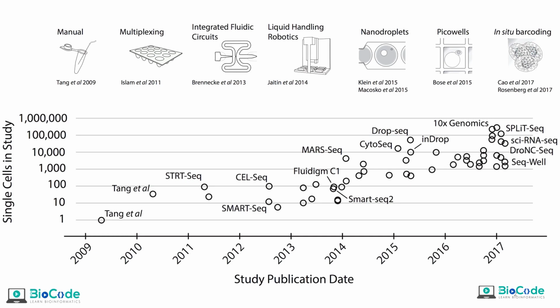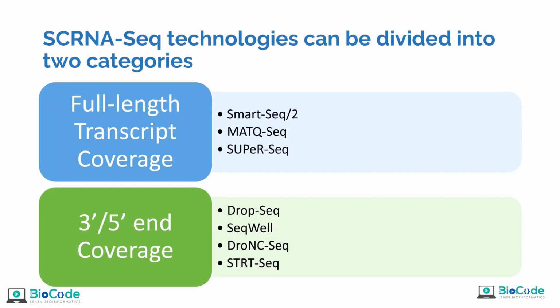Other than that, the analysis of the data generated from these technologies does not vary that much. The analysis procedures and the analysis steps are almost similar. The only difference is how the cells were obtained, how they were prepared for sequencing library, how the RNAs were extracted from them. That's it. Single-cell RNA sequencing has outgrown the other technologies, especially in genomics work, and it is a highly utilized technology and even has developed further technologies such as spatial genomics and spatial transcriptomics.